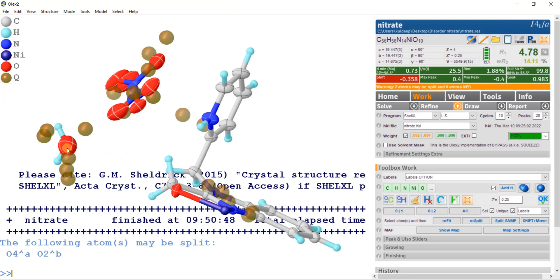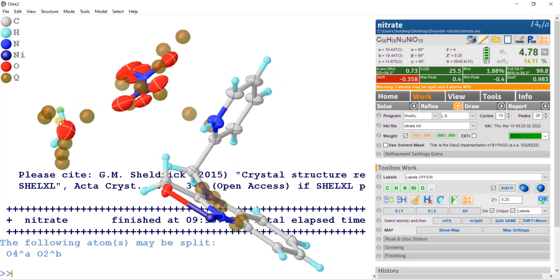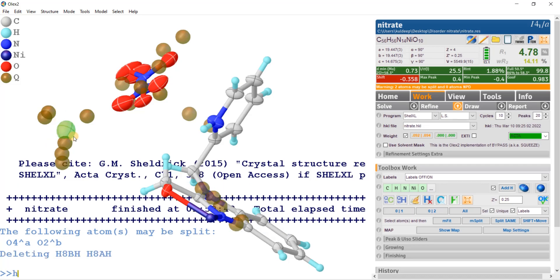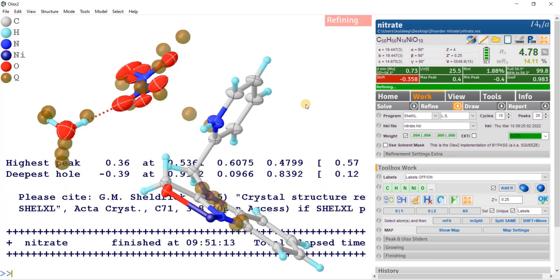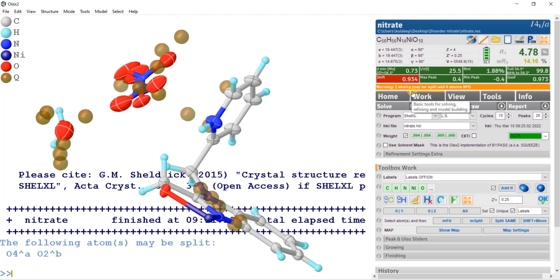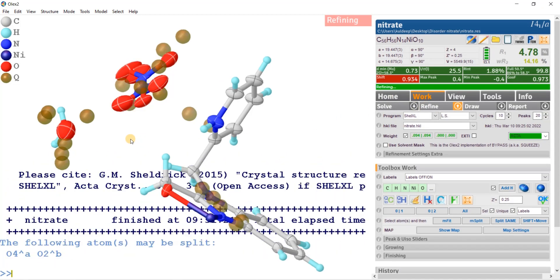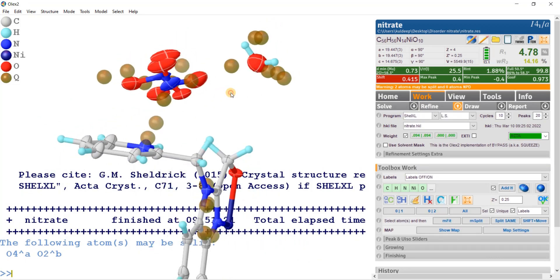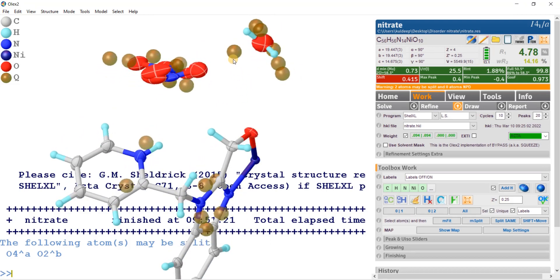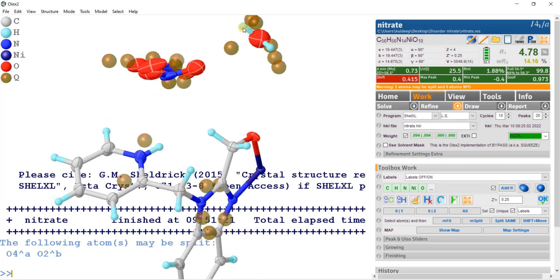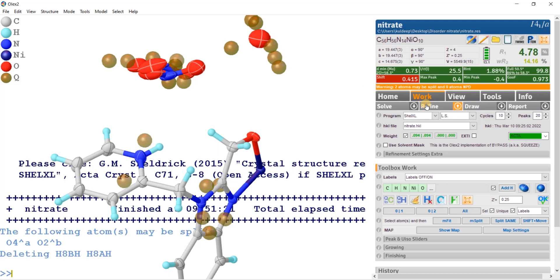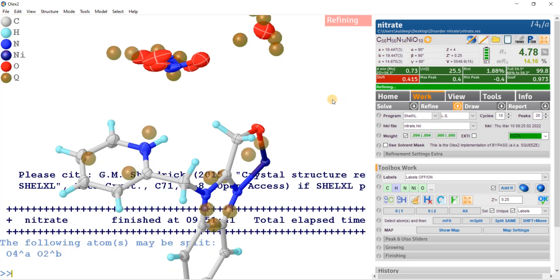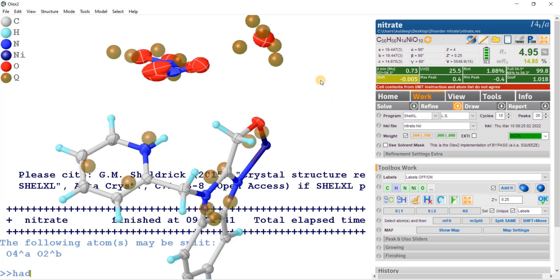The hydrogens on the water oxygen are not pointing in the direction of the nitrate oxygen for a hydrogen bond. Deleting them and adding hydrogens again — now the direction seems to be improving. Refining — the shift is still fluctuating. Deleting again, adding hydrogens, selecting all these atoms, putting the restraint AFIX 3, and refining. Still fluctuating — I will fit the hydrogen positions in some other tutorial.